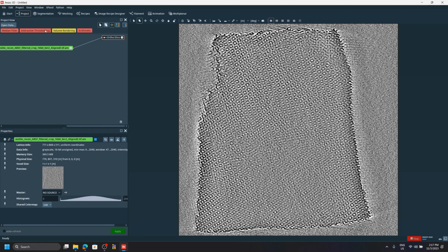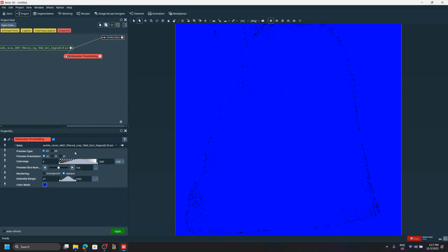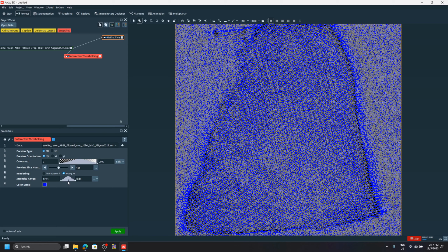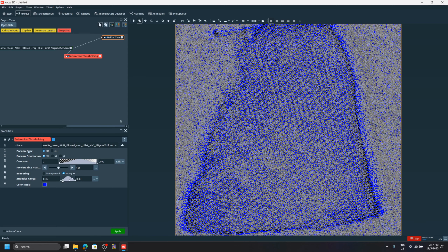Now, if you just use, let's say, thresholding, so I'm gonna try that, it's gonna be a mess, right? Because, as you can see, here I'm capturing the pores nicely, but a lot of the outside stuff is getting included as well, right?